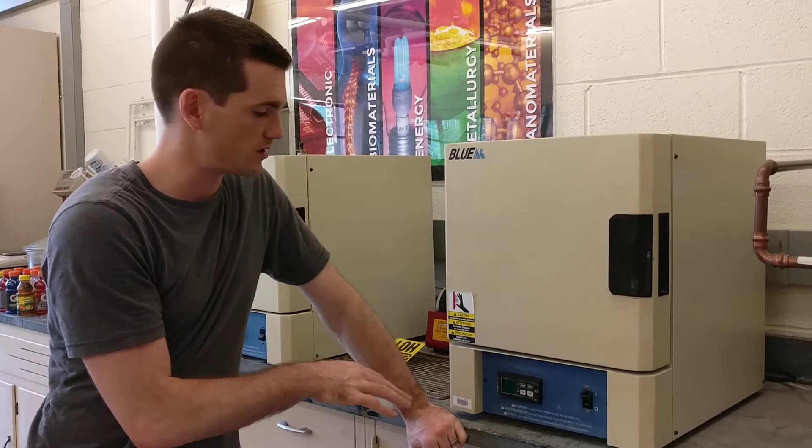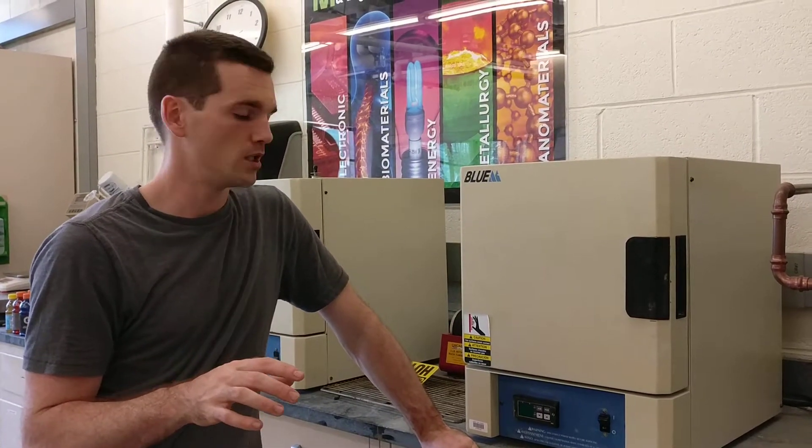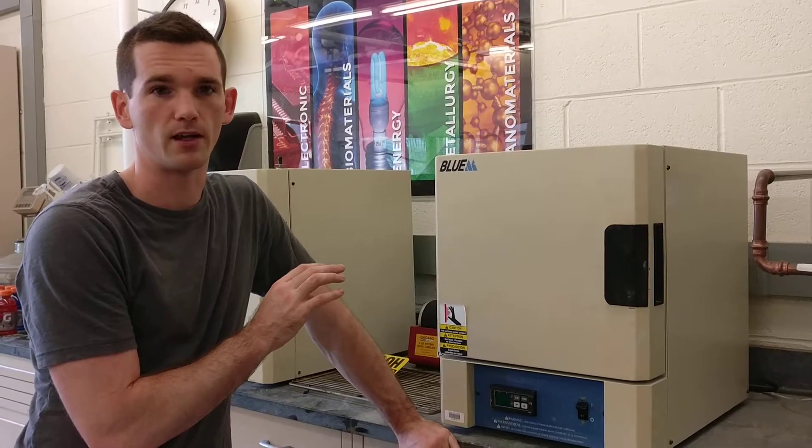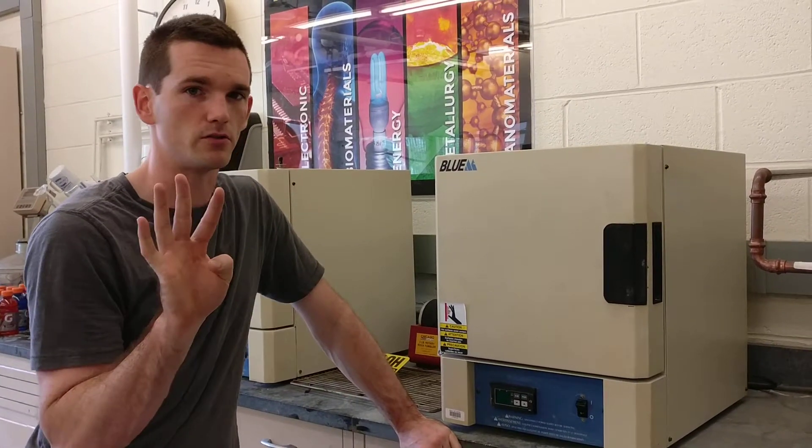I'll show you how to program these furnaces. There's one controller that looks like this, and there's another one on the other side of the room that's called UP150. For these furnaces, we typically use these in the sophomore lab to heat treat steels, or actually these are used to temper the steel.